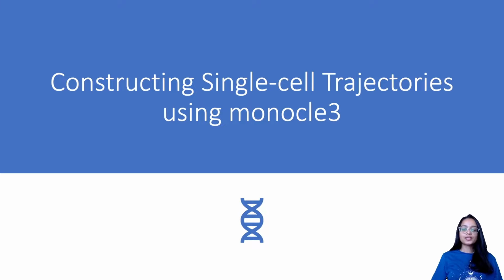So after a lot of you requesting a tutorial on trajectory analysis using Monocle3, I finally decided to create a video. So this video is going to be about constructing single cell trajectories using Monocle3.